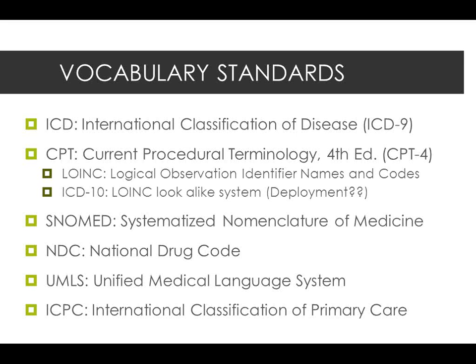Eventually, CPT-4 is going to be replaced by ICD-10, which initially will do all the ICDs, but will incorporate procedure codes. So it will be a combination of both the ICD-9 and CPT-4 process. But it'll be one set of codes that kind of covers both diagnostic and procedural information. Okay, not out yet. And the problems we have with CPT-4 and ICD-9s, I think, are going to look very small compared to the problems we will have with ICD-10.